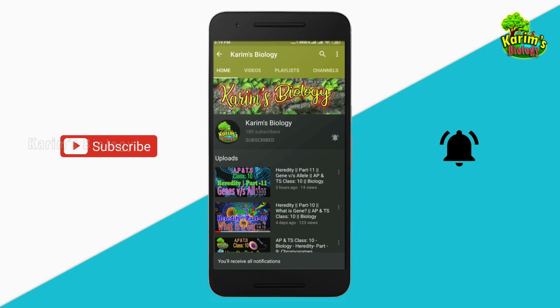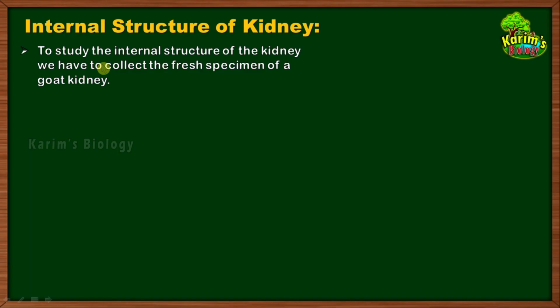To study the internal structure of the kidney, we have to collect a fresh specimen of a goat kidney. Dear students, actually we are studying the structure of the human kidney, but it is very difficult to get a specimen of a human kidney. That's why we go for another mammal, which is easily available.